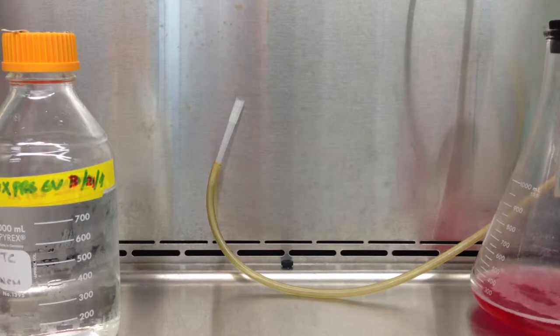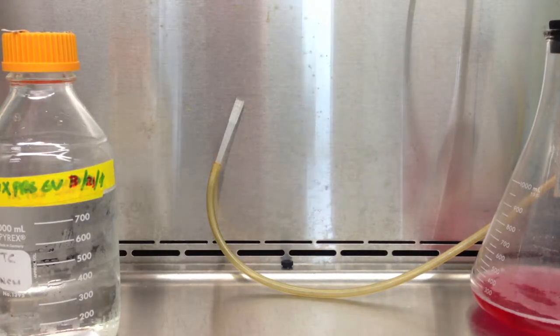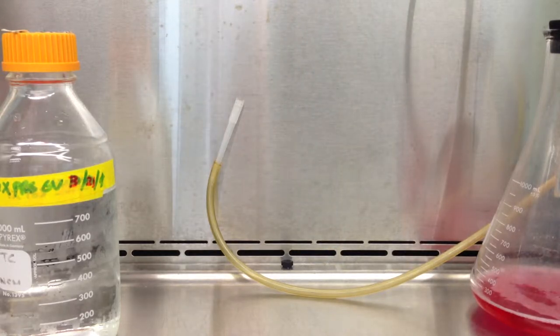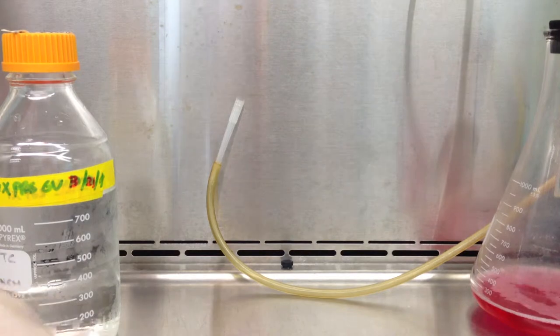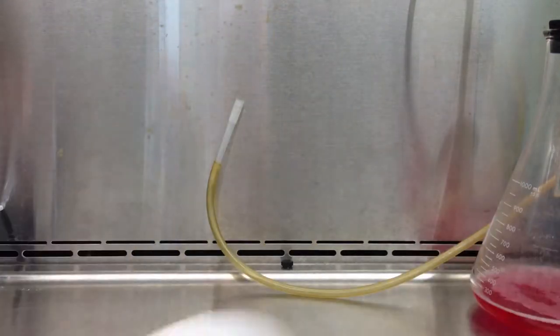I find that for T175s, 3 minutes is better. For T25s, 2 minutes is better. And for T25s, I use 0.25 milliliters of trypsin. Returning things back to the fridge.